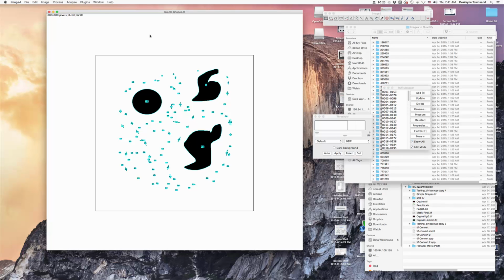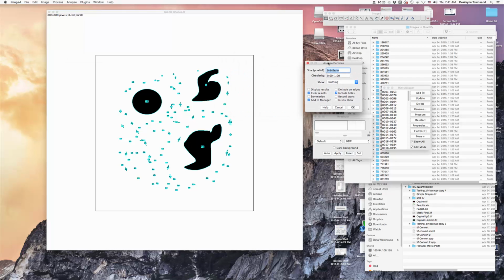It turns out there's another input to our analysis here, and that is the pixel size threshold. You can see here it's set to 0 to infinity, so any size at all, as big as it gets. This is something that we can adjust. I'm going to set a lower level threshold. For the myocytes, the practical example is about 1,000.